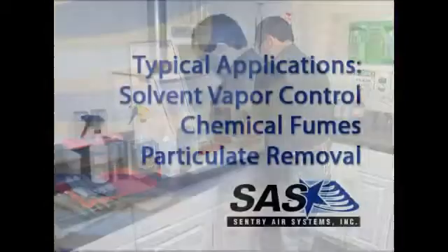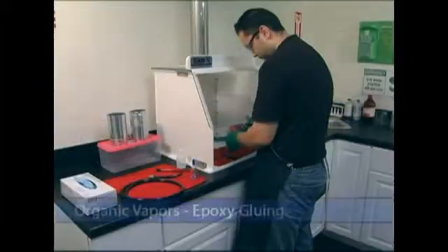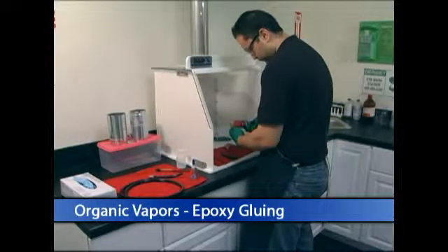Applications include chemical fume control, organic solvent control, particulate removal, biological applications, capsule filling, and a variety of other processes.